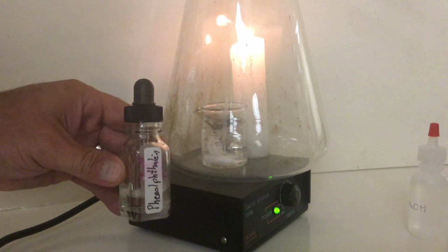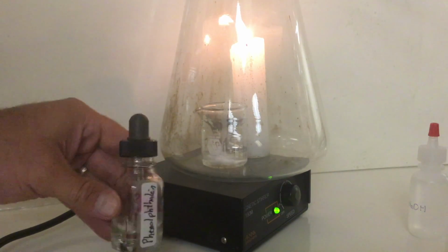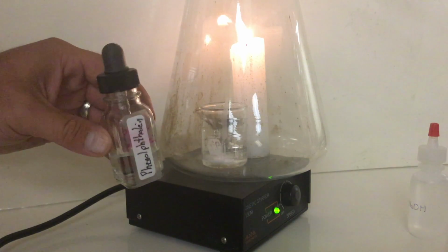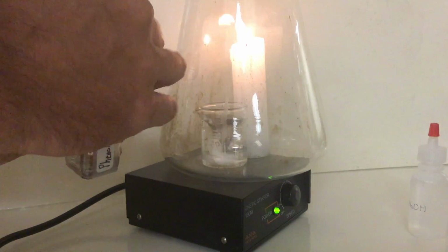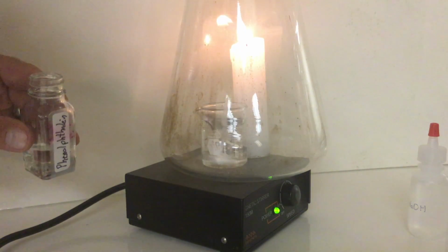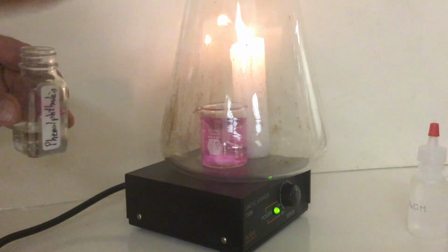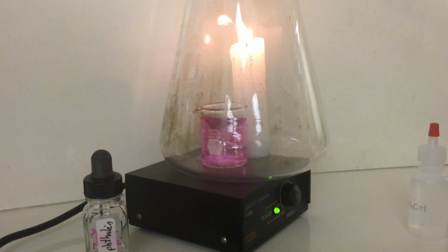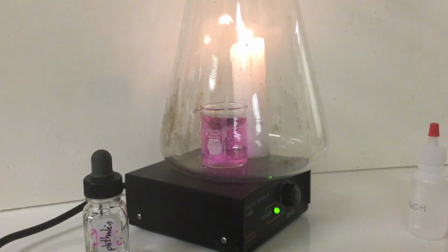It's a mouthful. Now, phenolphthalein is clear when the chemical is an acid, and it is pink when the chemical is basic. So let's see if it's acidic or basic. Ooh, so you can answer that question. Again, pink when it's basic, clear when it's acidic.